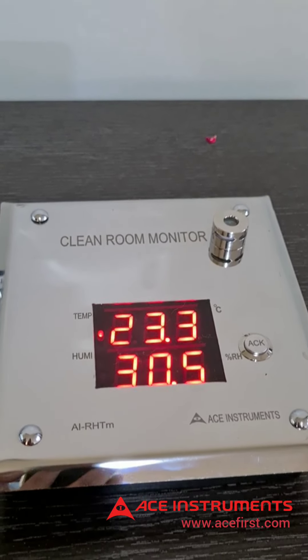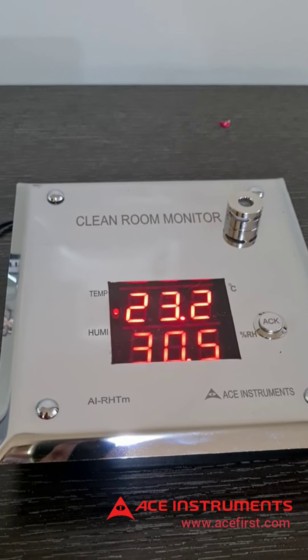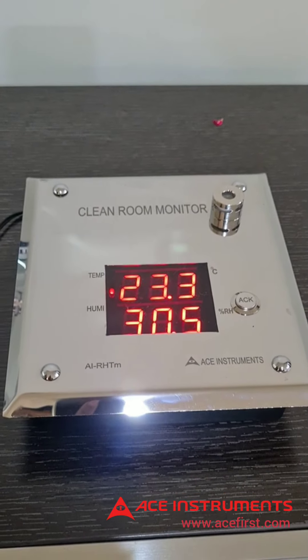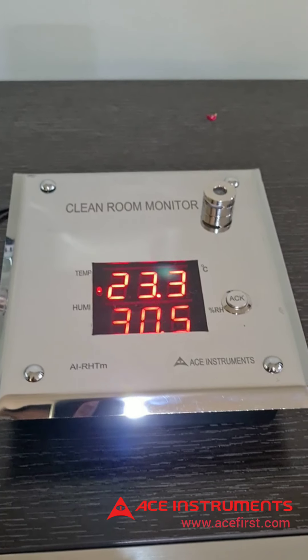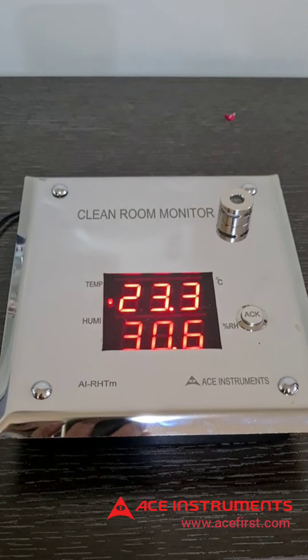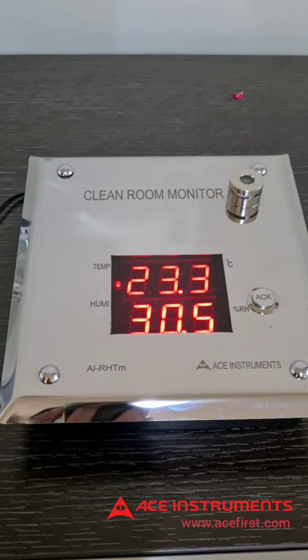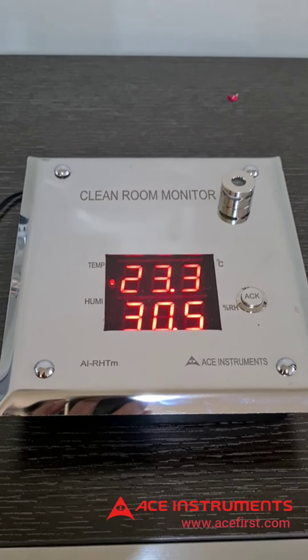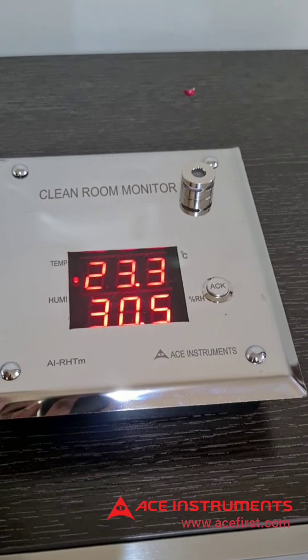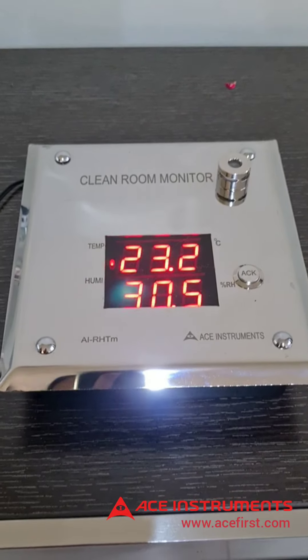The humidity temperature monitor has an integral buzzer alarm which can be programmed by users for any range — both low alarm and high alarm for each of the parameters of temperature and humidity — so that the user is alerted on field if the temperature or humidity readout is either lower than or exceeds the desired readings. The buzzer alarm can be enabled or disabled through programming depending on usage.